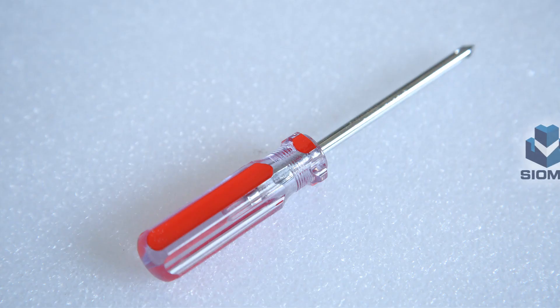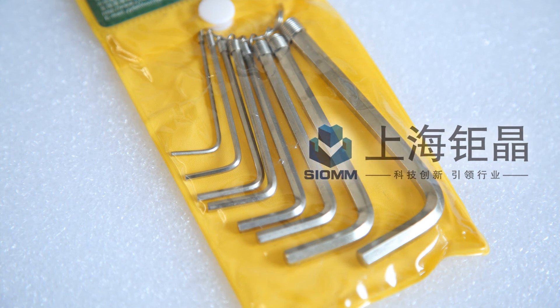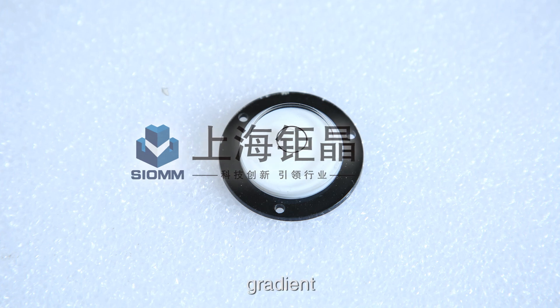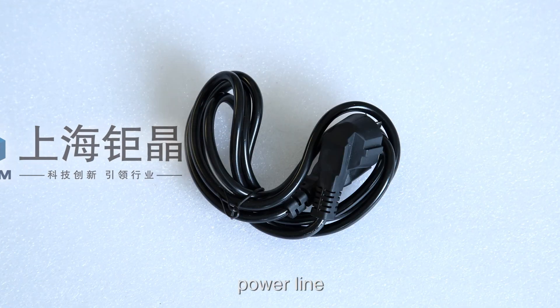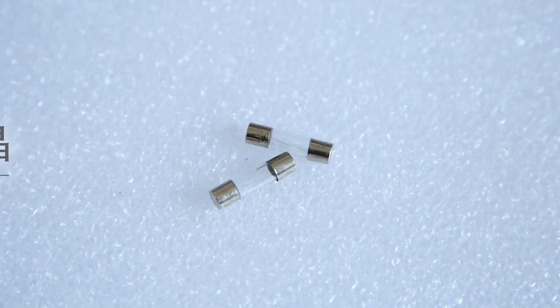Additional accessories include: Small Path Fixture, Open Spanner, Phillips Screwdriver, Allen Key, Horizontal Adjusting Screw, Gradient, Power Line, Fuse, and Sucker.